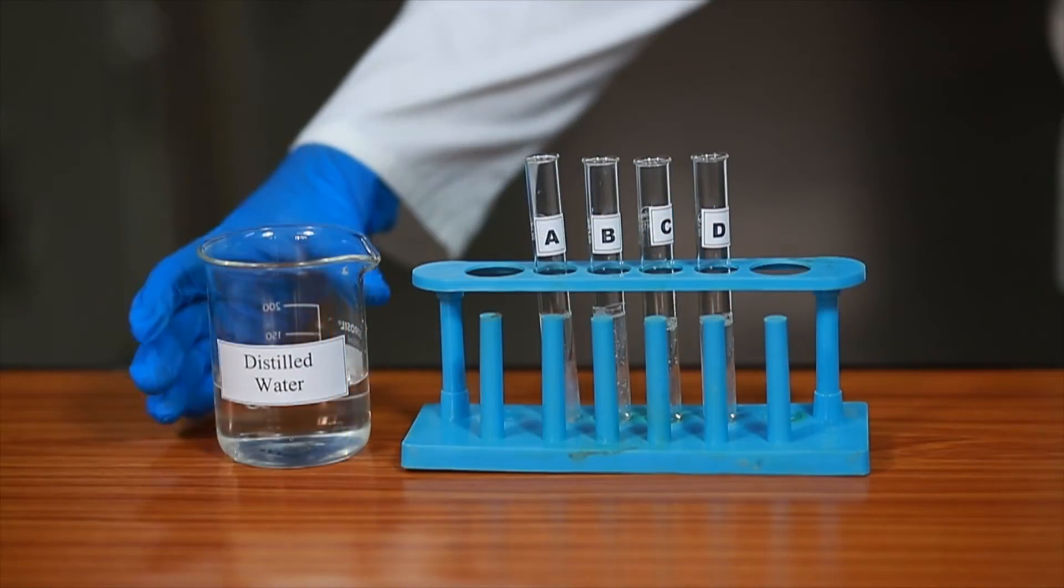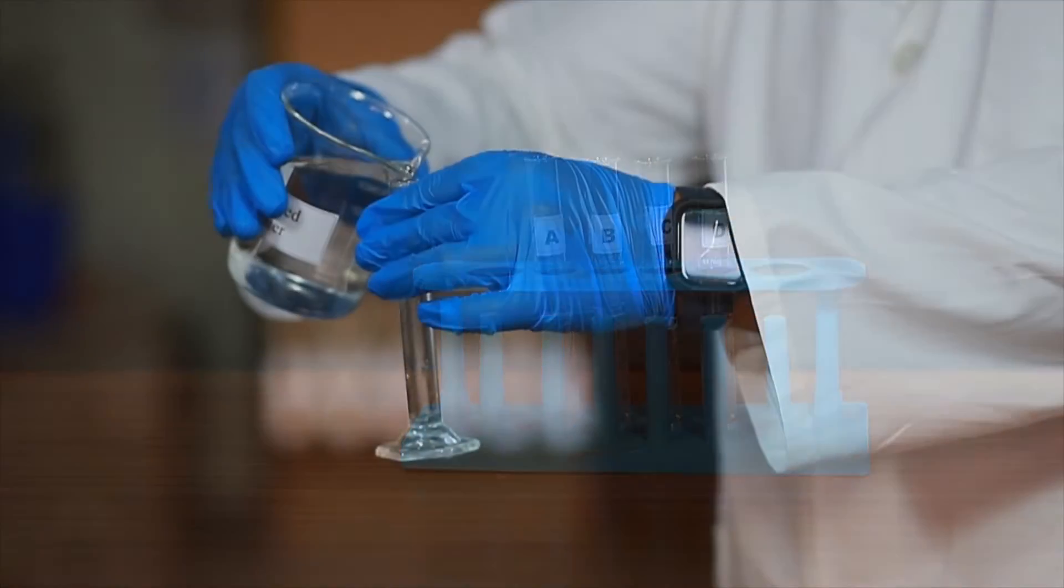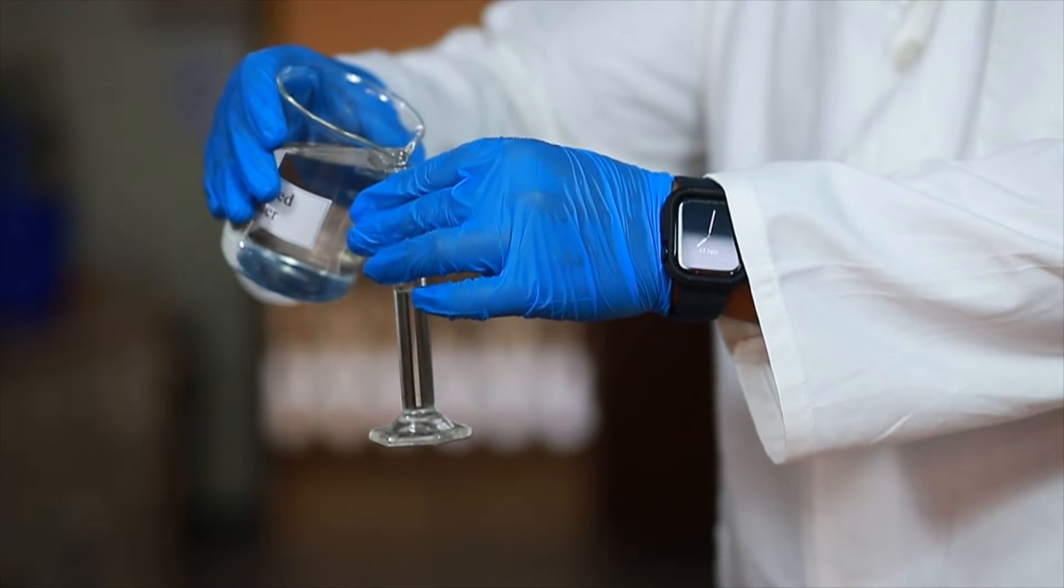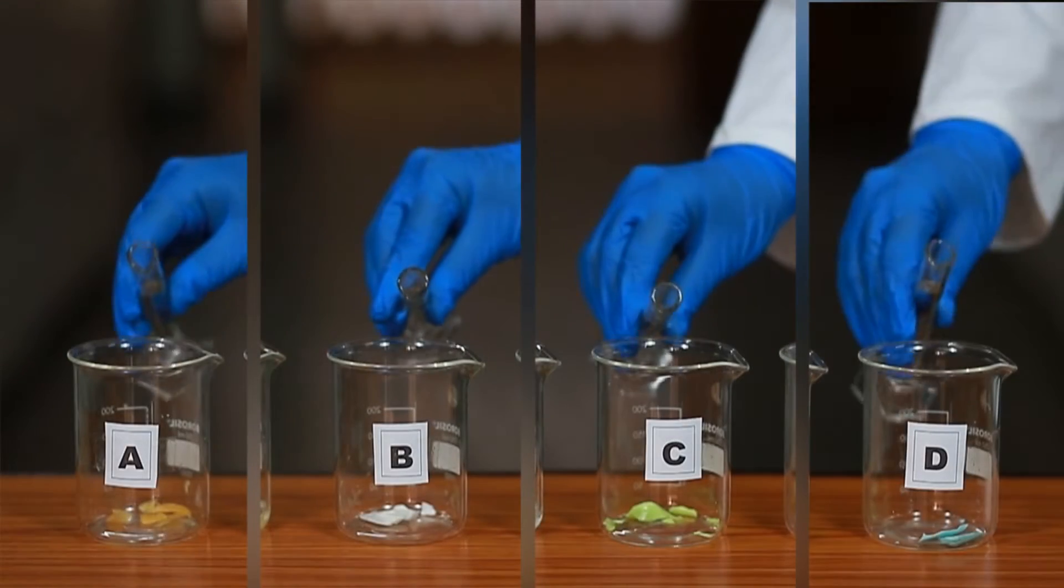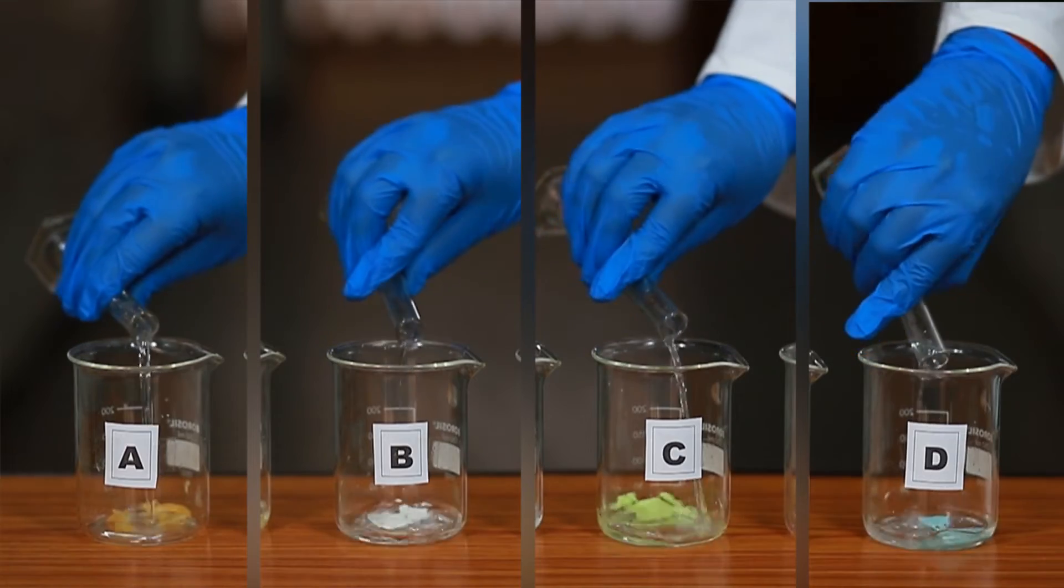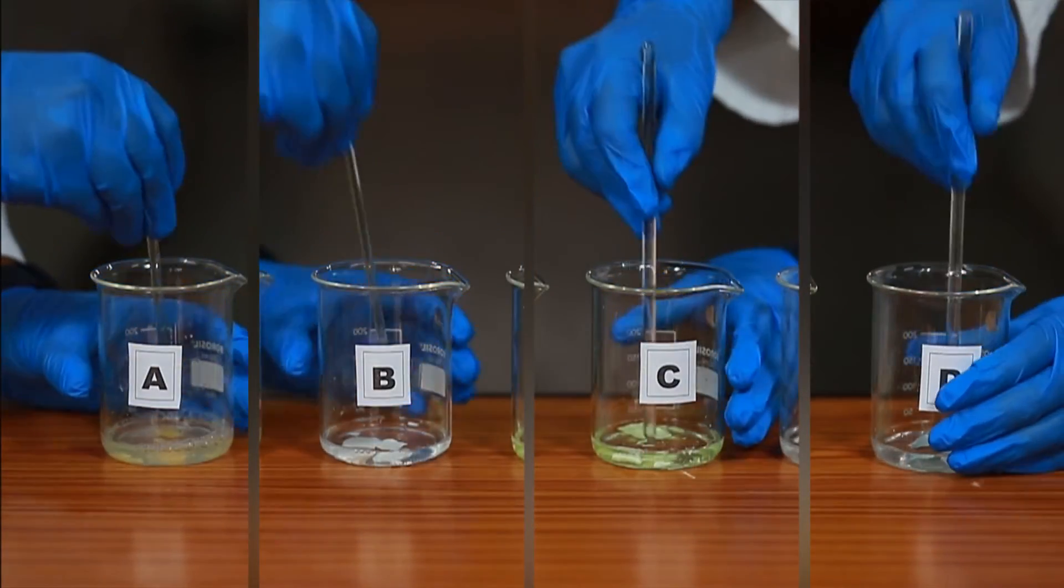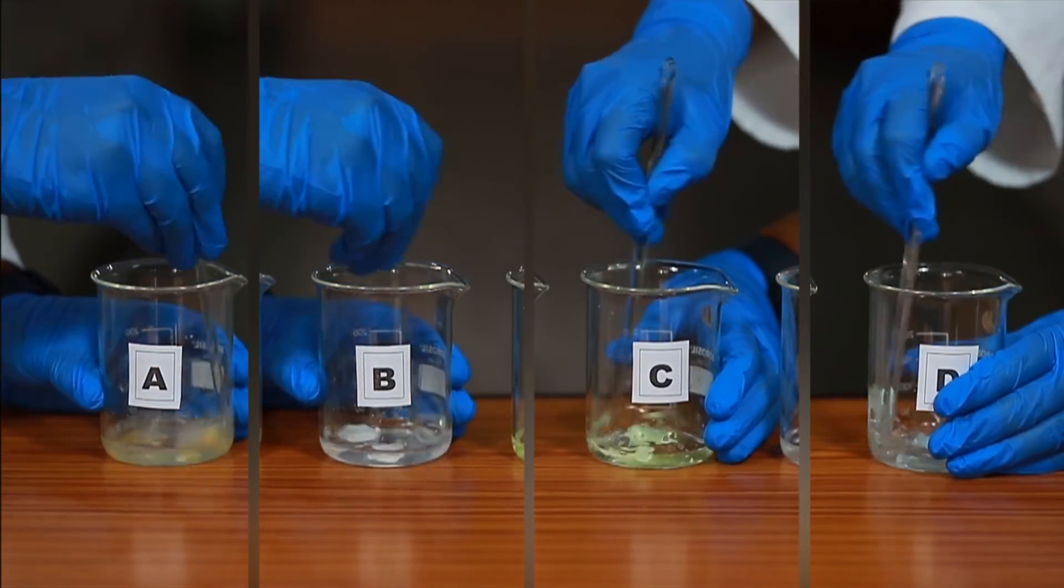Using a measuring cylinder, add 20 ml of distilled water to all the soap samples from the beaker containing distilled water. Dissolve the soap in water by stirring the mixture with a glass rod.